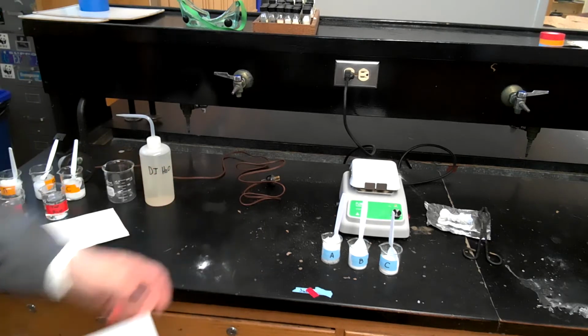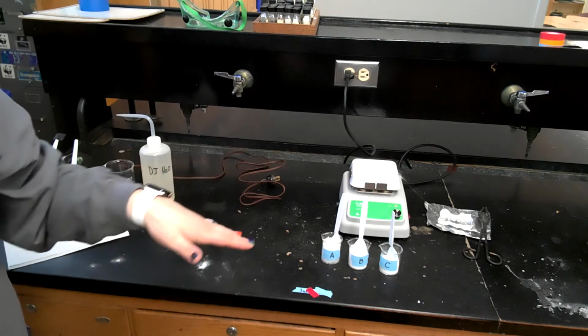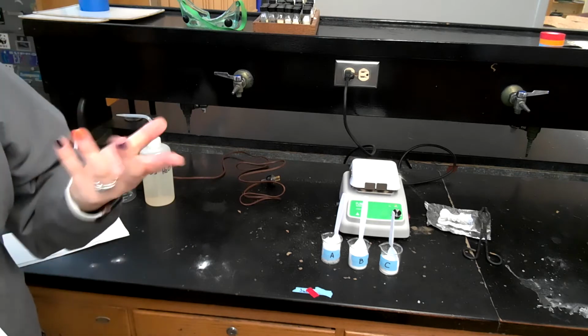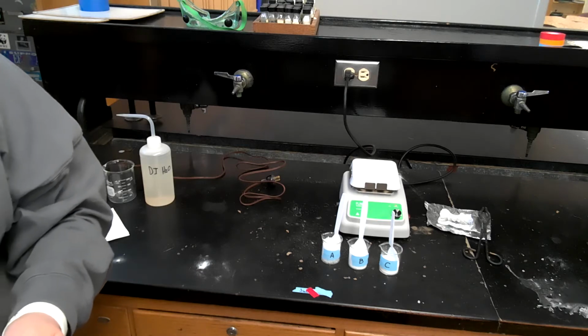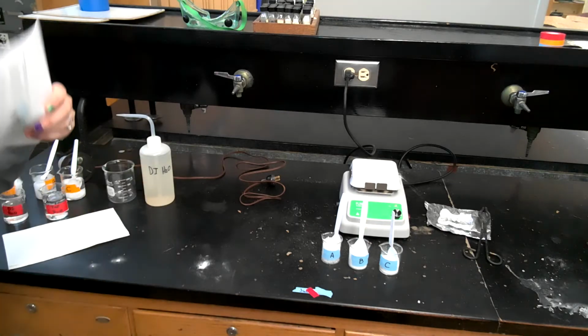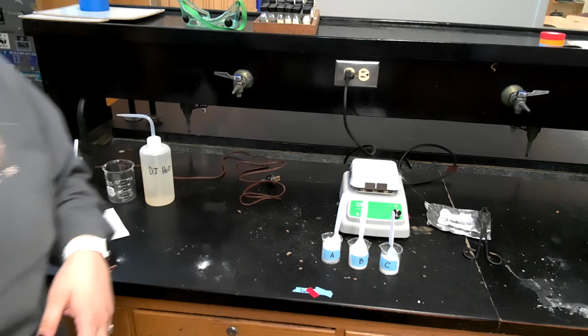Today we're going to do the determining the types of bonds lab. So we have these 3 unknown substances, but you did some reading the previous night on 3 different types of compounds, and the 3 types that you read up on were paraffin wax, fructose, and sodium bicarbonate. So you read up about them, you talked about what kind of bonds they have, what their chemical structure was.